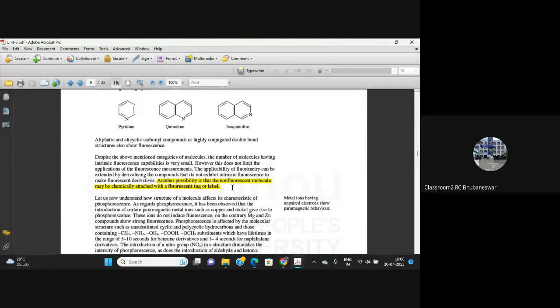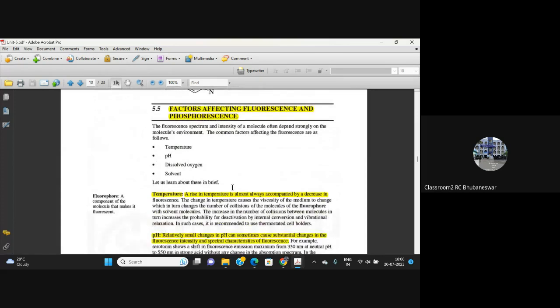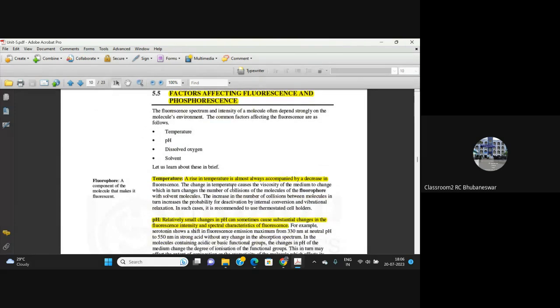As long as you are studying the biological fluidic medium, you can take the fluorescence imaging of that. Last class I was telling you about the neuron image. You saw the neuron is so thin. But by using fluorescence spectrophotometry, you can study the structure of the neuron. So that is so powerful. The main important thing with fluorescence is that it is very, very sensitive. Even a micromolar concentration of a substance is good enough for studying fluorescence spectroscopy. That is the best beauty of fluorescence spectroscopy.